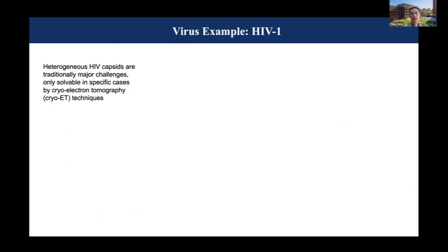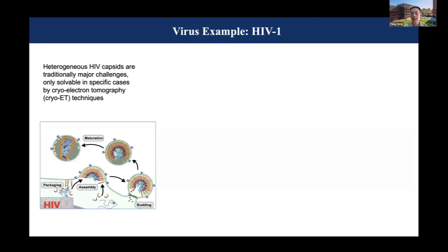We traditionally study HIV, one of the viruses, of course, a pandemic causing virus. The challenge for HIV is that it's not your typical very highly symmetrical, flu-type particle with nice icosahedral symmetry, where you can do traditional single particle. For HIV, in illustrations you see nice symmetrical particles.